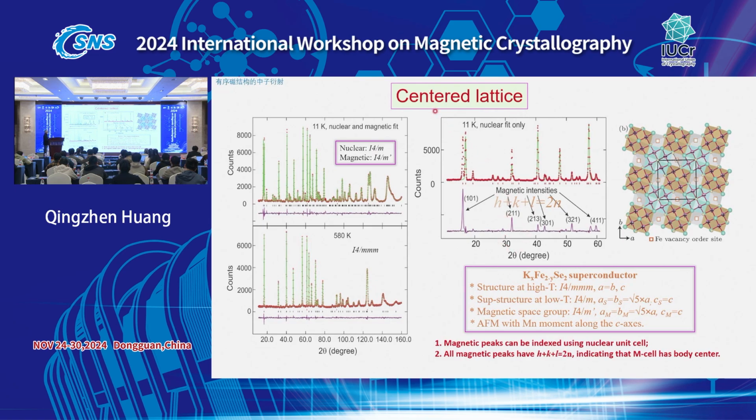Here, on the first day, I was introduced to some of the lattices. This is another compound with a superlattice, a nuclear superlattice, and magnetic order at 11 Kelvin.